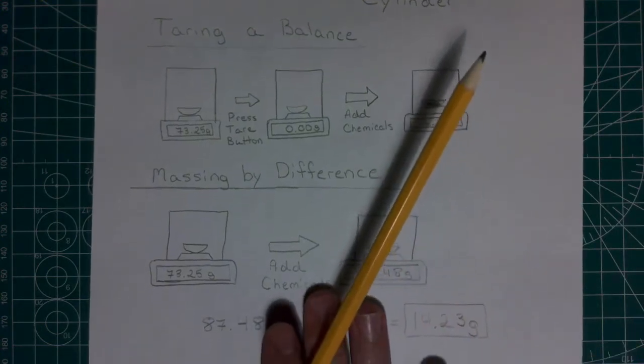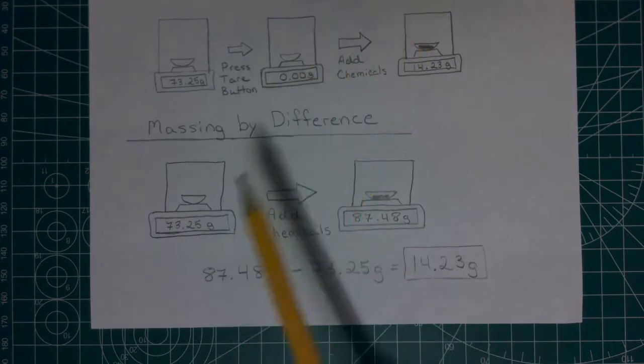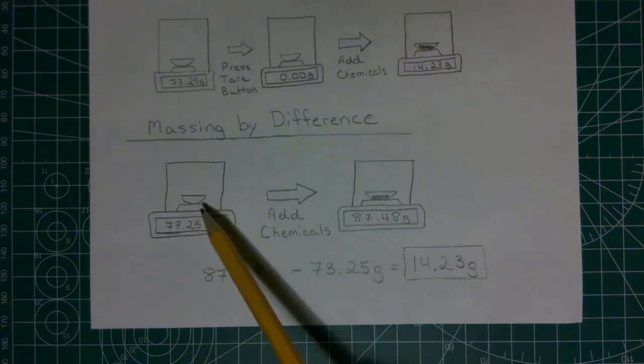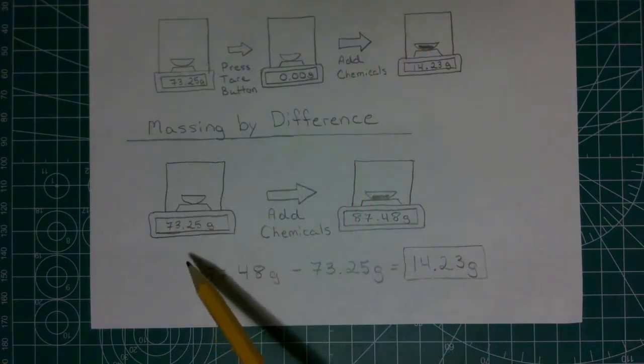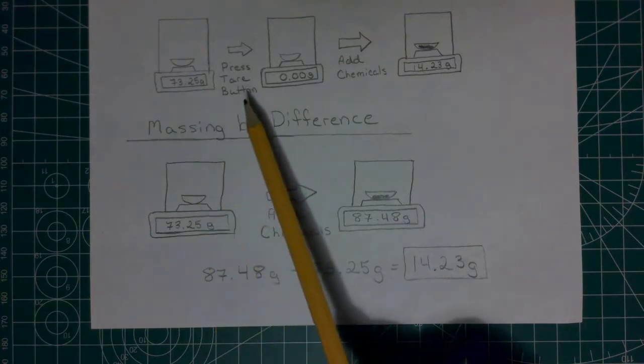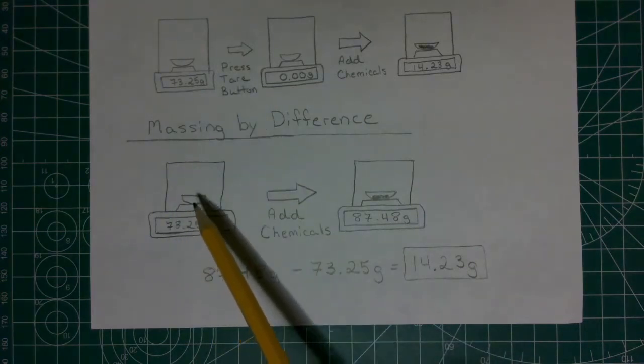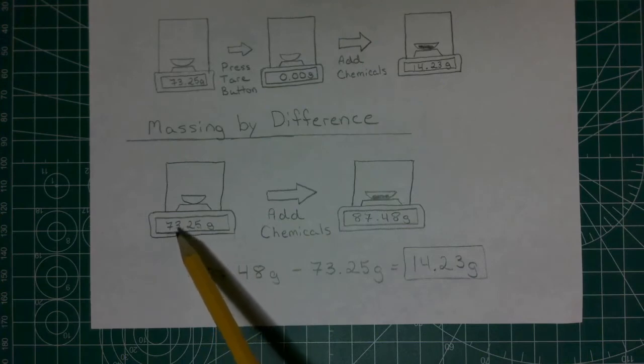Instead, what we're going to do in this lab, we're going to be massing by difference. This is where I just have it zeroed out with nothing on the pan. You would do that by pushing the tare button, and then I'm going to put the container on there, and I'm going to see the container has some mass, in this case 77.25 grams.